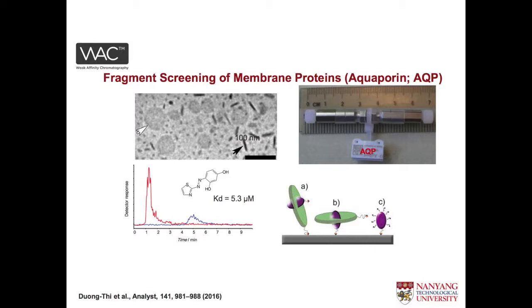But this is the first example of this, and it needs a lot more work, and maybe that's something I'm hoping to do more in the future, to see that we can apply the WAC technology more onto membrane proteins. It is very challenging to handle this with this technology and other technologies. But I just want to illustrate that we have tried to work also with membrane proteins.